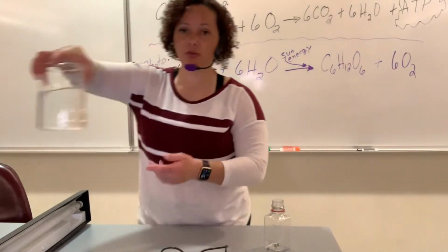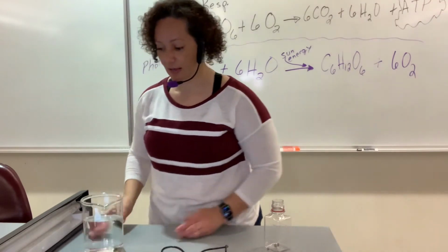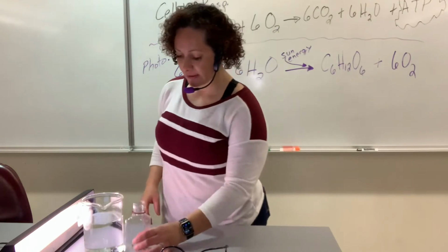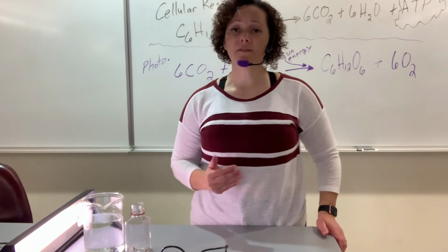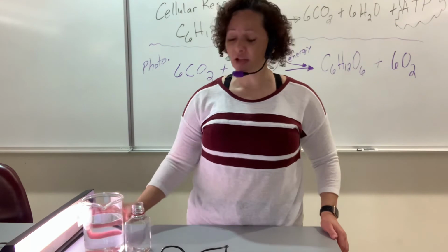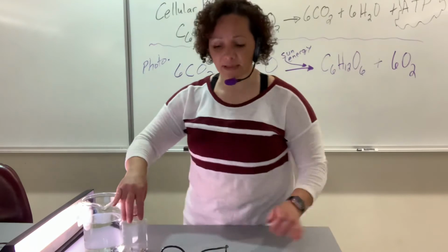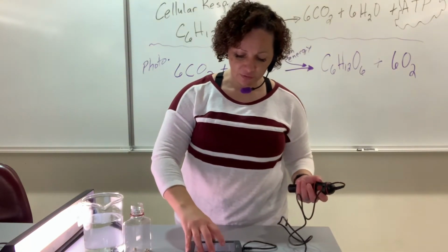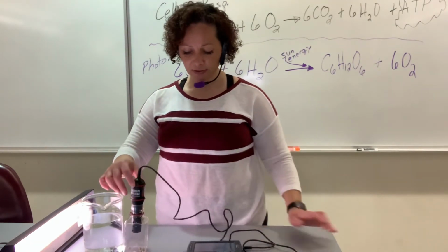So make sure you put some water, a beaker of water, in front of your light. Okay? That way when you turn on your light, you want to put your organism directly in front of the water. Because if you recall, water has a very great ability to absorb high amounts of energy without having large changes in its own temperature. All right, so you're going to put your organism in the light. Make sure you clear your data. File, New, discard, 3 minutes, do it all over again.